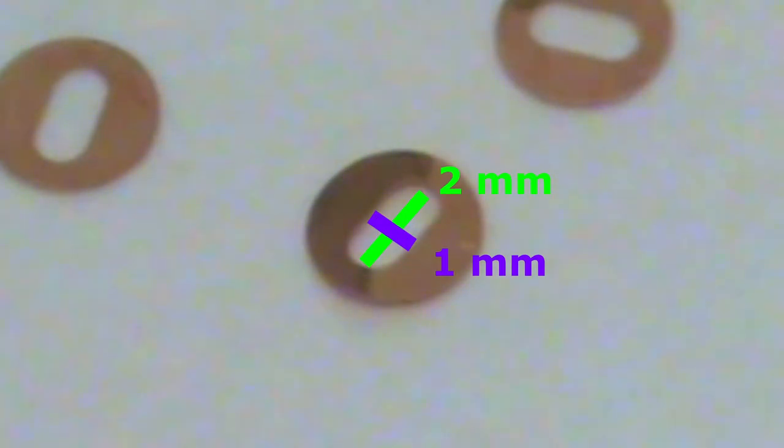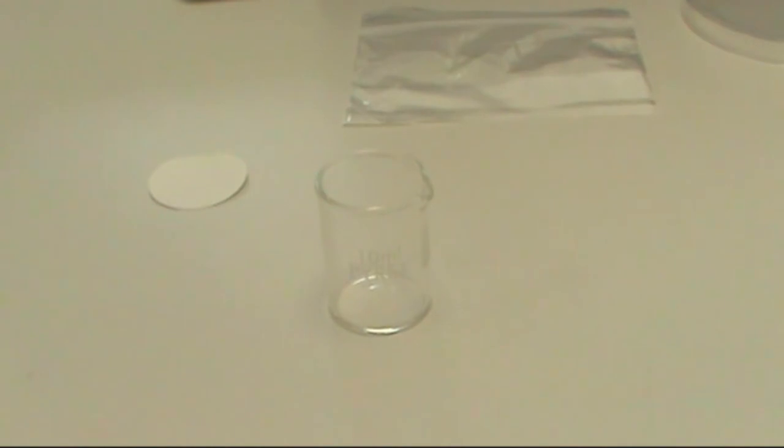are for serial EM tomography. I'm going to use copper slot grids. The ones I prefer are the ones that have a slot of 1 by 2 millimeters in the center. First of all, you need to wash the grids.